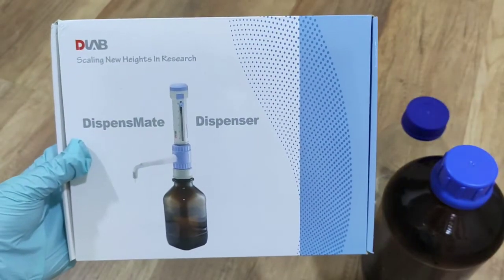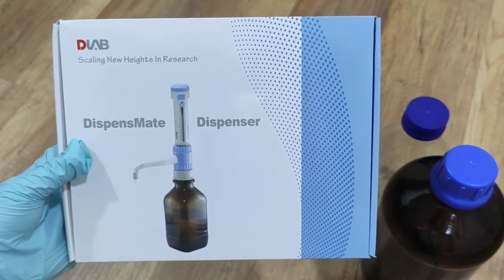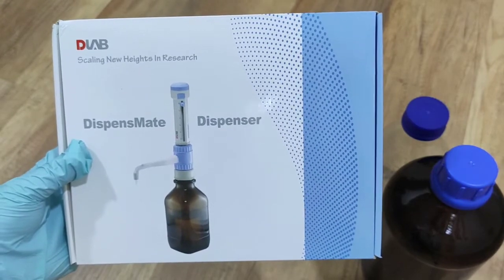Hello everyone, I'm going to introduce you to the bottle top dispenser made by D-Lab.